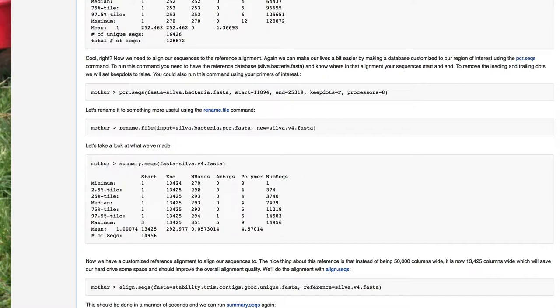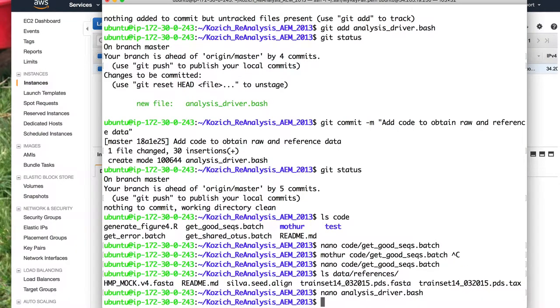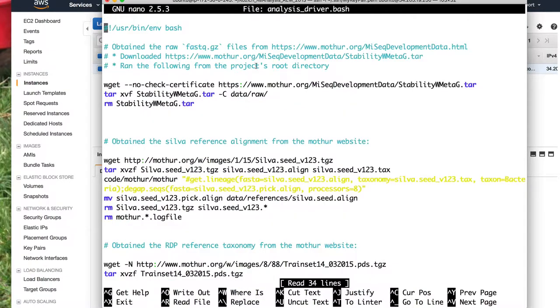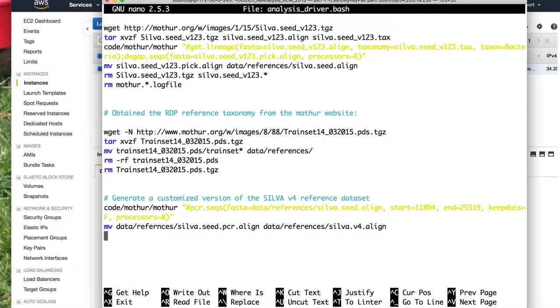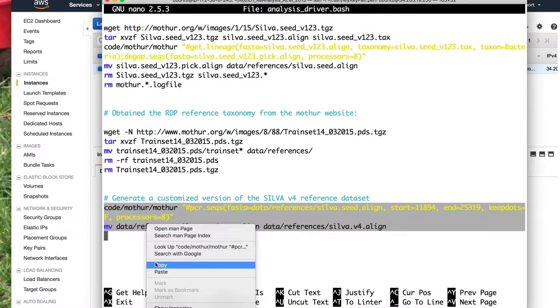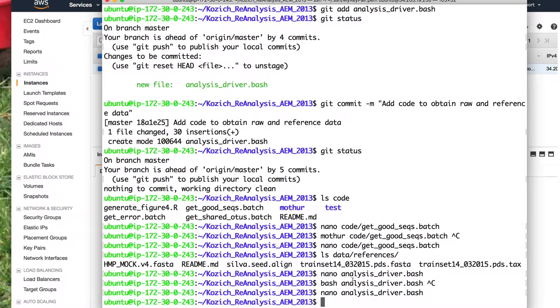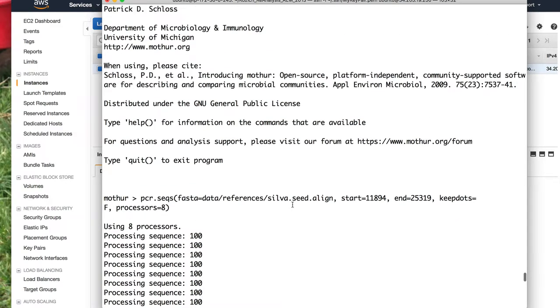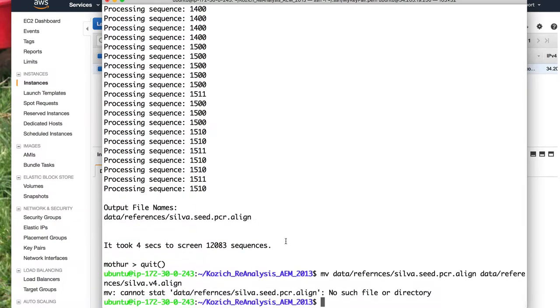So if you're wondering where all the commands come from in those batch files, they're all listed on the mothur wiki. We could run bash analysis_driver.bash again, but that's going to download everything again — that's one of the problems with our analysis driver bash file as currently structured. So I'll copy the lines from the bottom of the driver file and paste them into the command prompt to just run that section. It's running the pcr.seqs command.